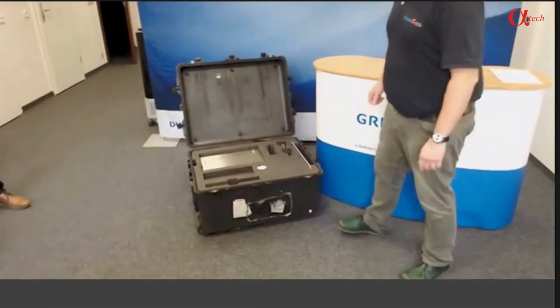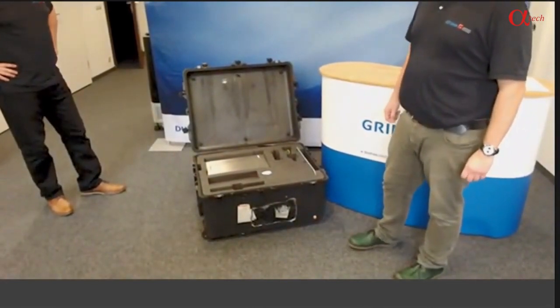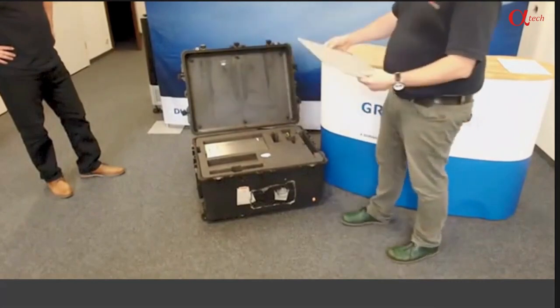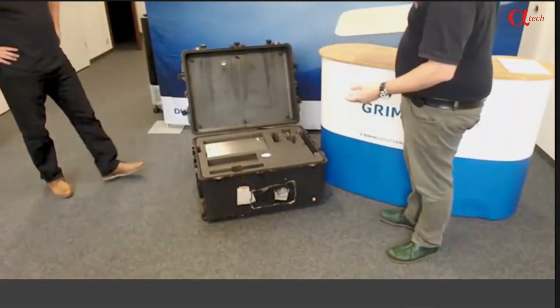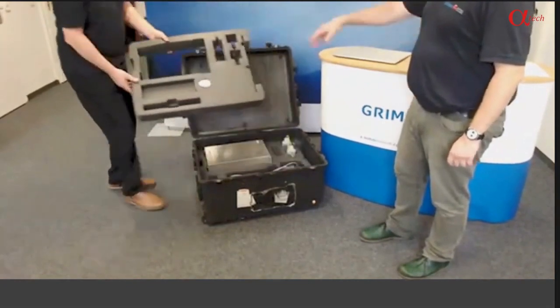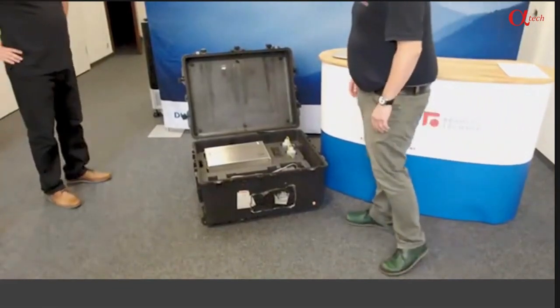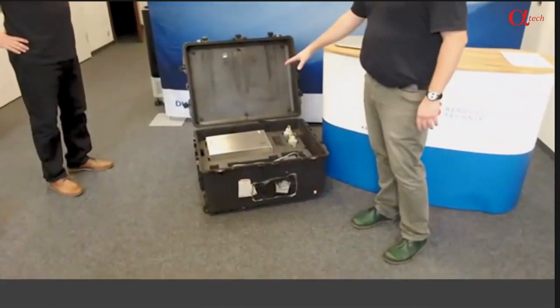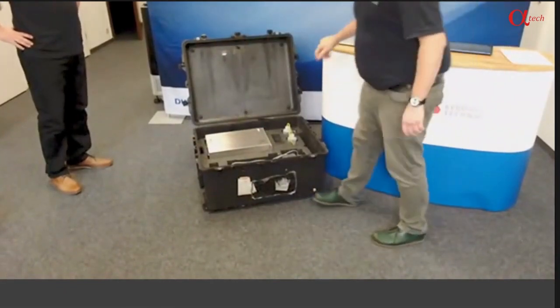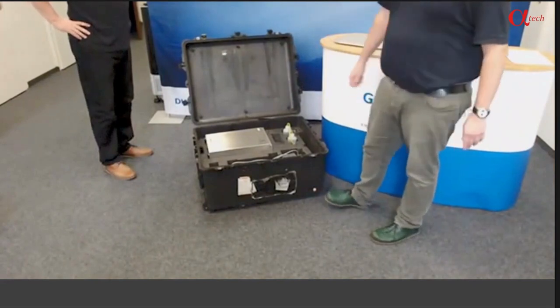On the second layer, you can already see the main instrument, the 5416 CPC. There is also a first accessory to take out — a base plate where we can put all the other instruments on top later on. Removing that layer, which also includes a universal power plug, you can see more instruments: the CPC, a compartment for the measurement computer, a compartment for the differential mobility analyzer, and another one for drain and butanol fill bottles.